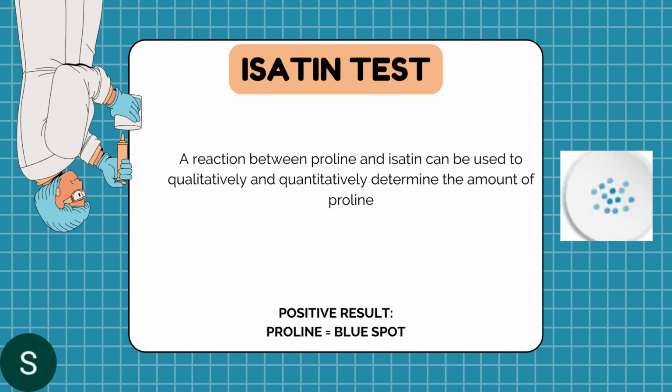So, what is the positive result for this test? You get blue spots, which you specifically count. Okay?